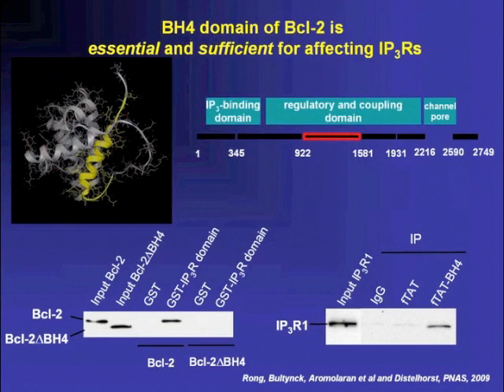So in fact, why did we then go on and look for alternative methods? Of course, research-wise, we wanted to explore the BH4 domain's characteristics and functions, and develop mutants and variants. We wanted to develop membrane-permeable variants for cellular applications, but also wanted to develop some affinity purifications and detections for immunofluorescence and Western blotting. So for us, it was clear we needed to invest in an alternative method to develop peptides.